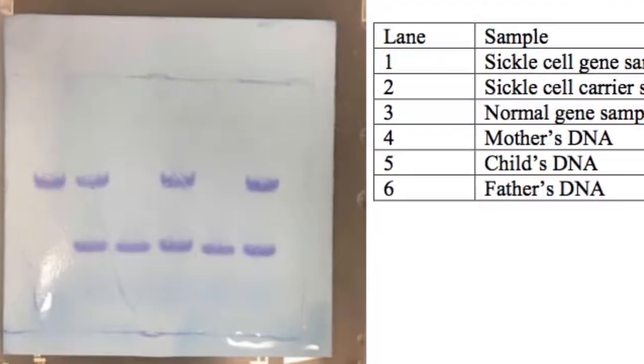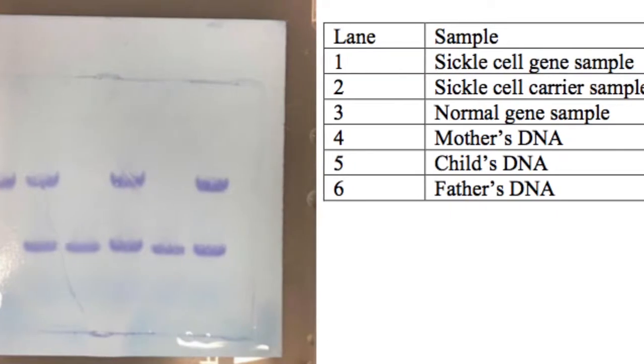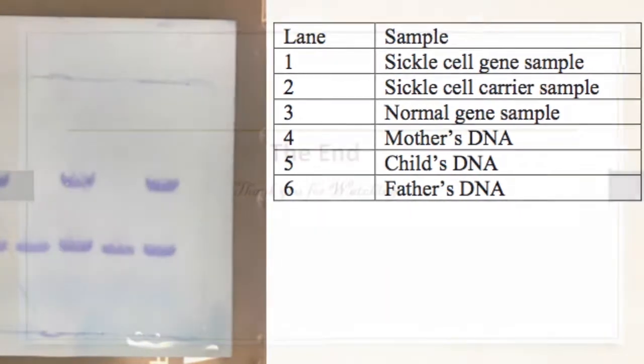This is our final result. As we see, the bands are pretty visible. Both parents are carriers as indicated by the 2 bands. However, their child did not receive any of the sickle cell trait.